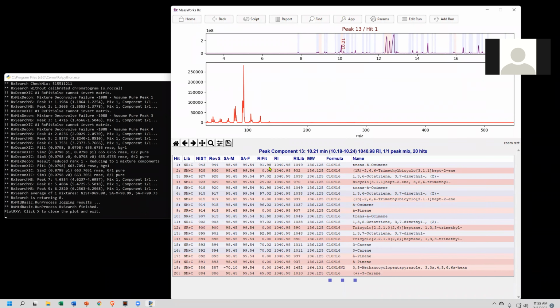Well, you'll see here at the top, there's this one. All of these you need to consider as candidates, from really at least the 12 all the way on up. You'll see that they all have good spectral accuracy matches, so that we know that's the formula. And the forward and reverse each match up. We know it's not a mixture.